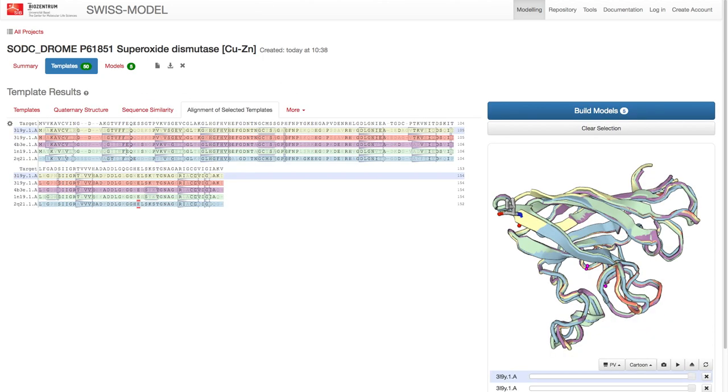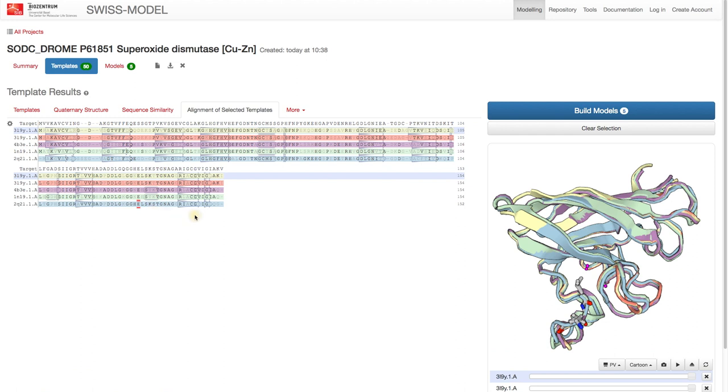If we go back to the template alignment view, we see that both the structure and the sequences differ in the loop regions.